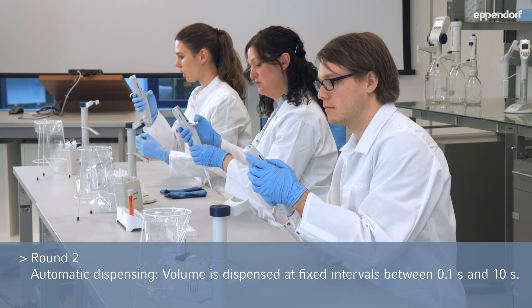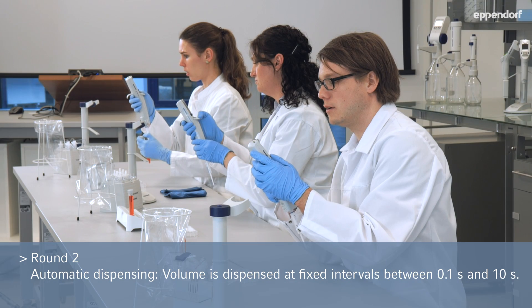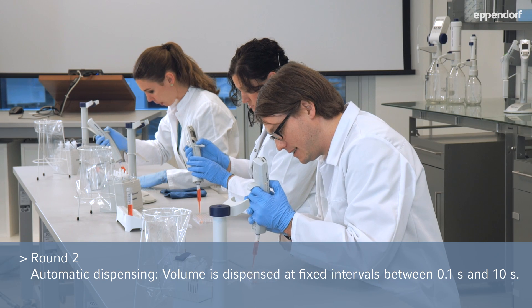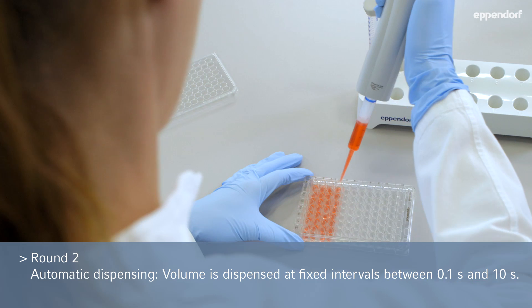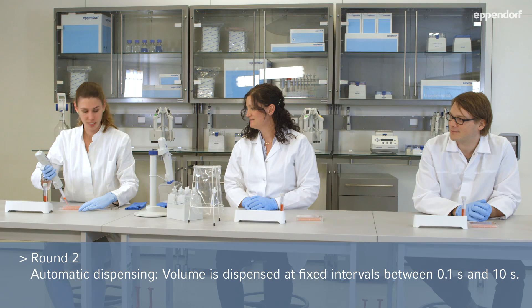Which time intervals do you set between the individual pipetting steps? I set one second, so I don't have to hurry too much. I set 0.3. 0.5 seconds is just perfect. 0.3 is just okay. If the liquid is dispensed less quickly, it is better distributed over the entire well. There is even enough time to look around.